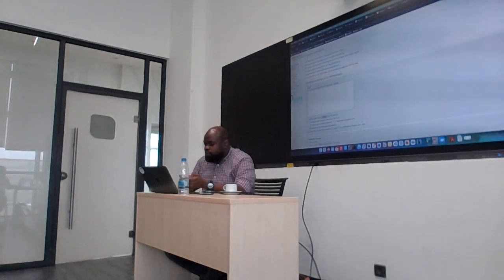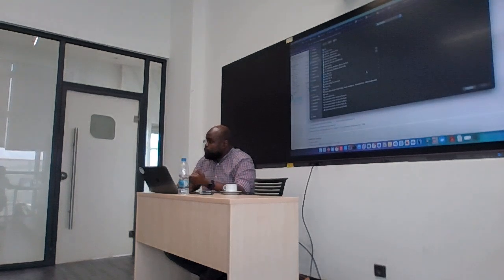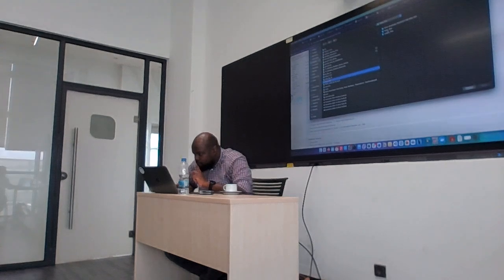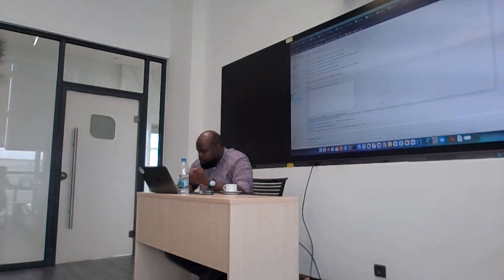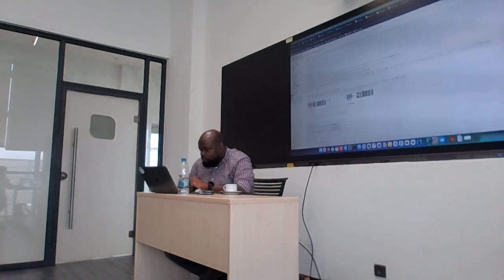So here you just need to upload your sequence and then it will do the alignment for you. Okay? So I'll give you an example here. I can give the MAFFT server, I don't need to change anything, and then I'll just submit.